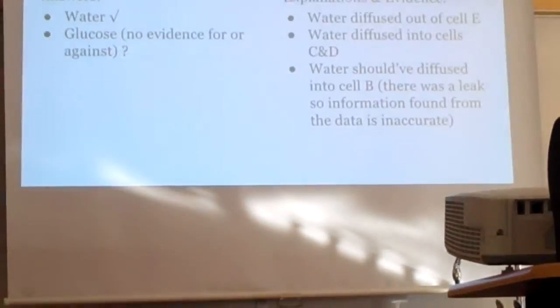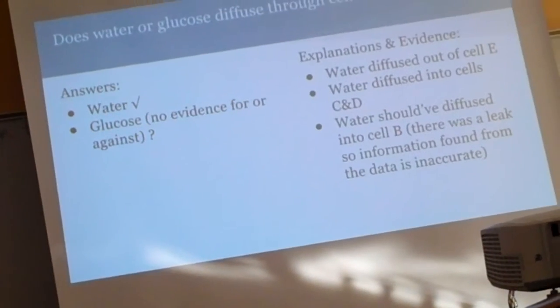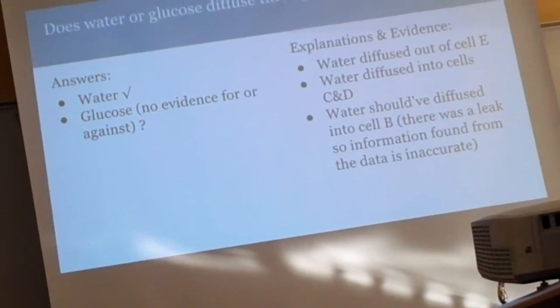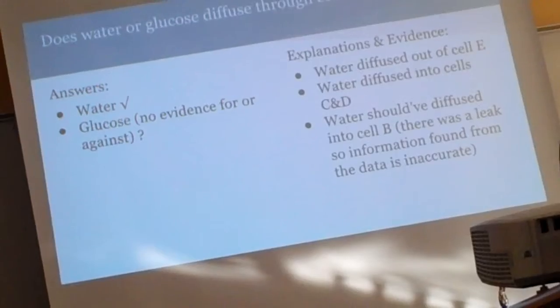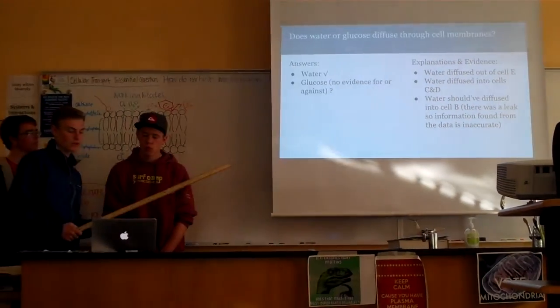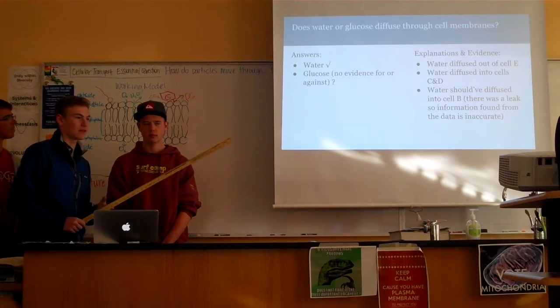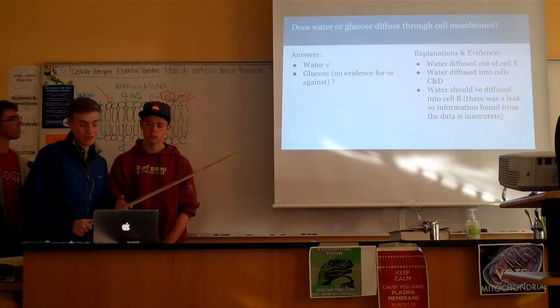So does water or glucose diffuse through the cell membranes? Water did definitely go through the cell membrane, but there's no evidence supporting or going against glucose traveling through the cell membrane. There really wasn't anything on the slide.